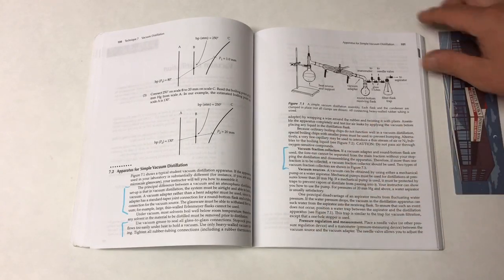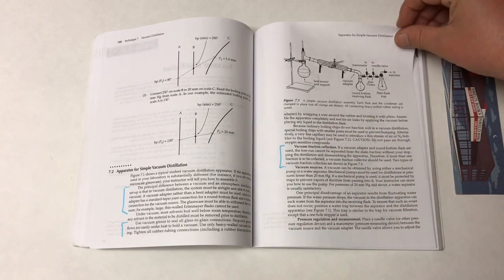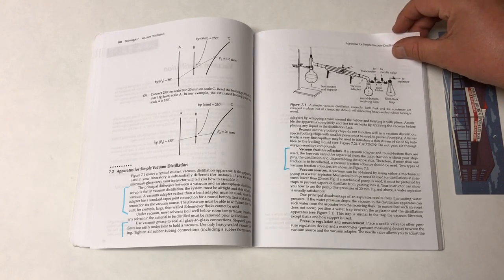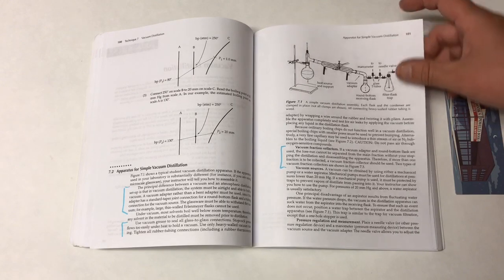the distillation flask. So when we set up our distillation apparatus, one thing that we do before we add our material is we check for any air leaks.